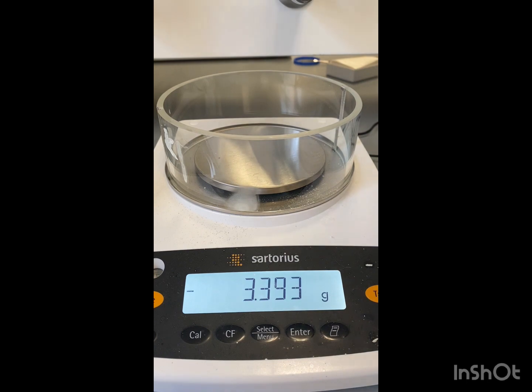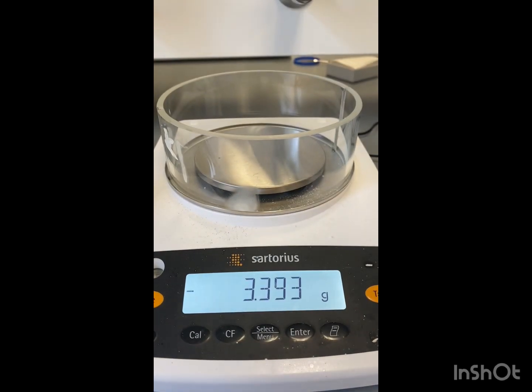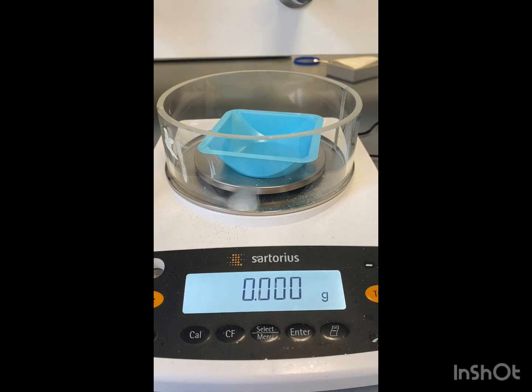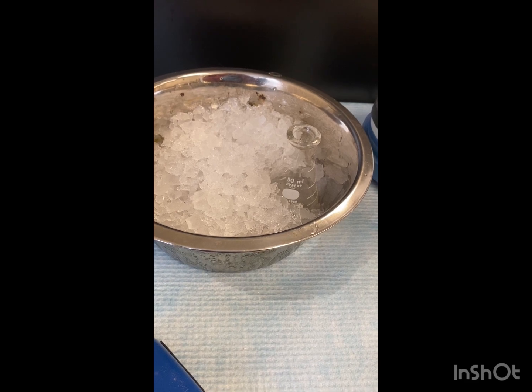Now we're going to add 300 milligrams of our sodium iodide. Our sodium iodide is 318 milligrams. We're going to add that to our reaction flask, and then we're going to cool it in an ice water bath. So we're letting our solution cool in an ice water bath.